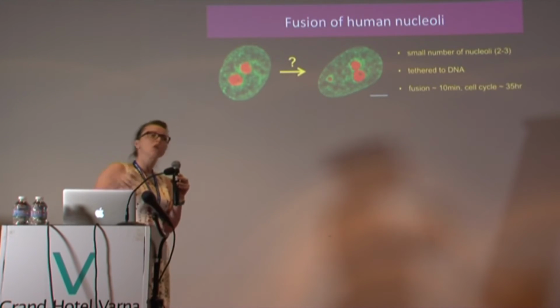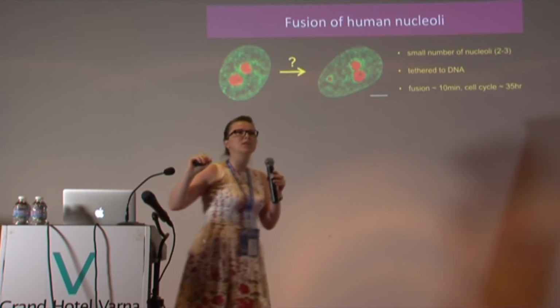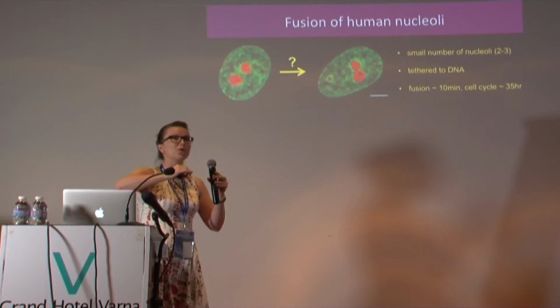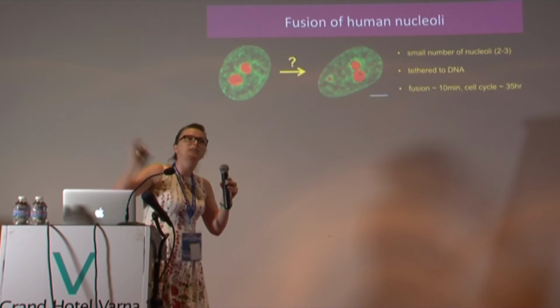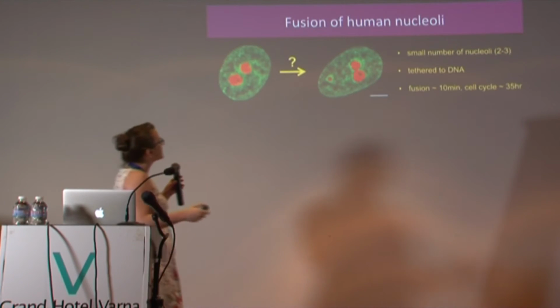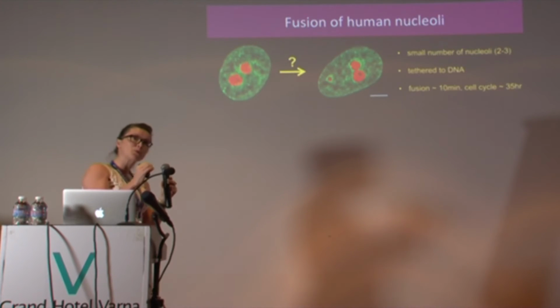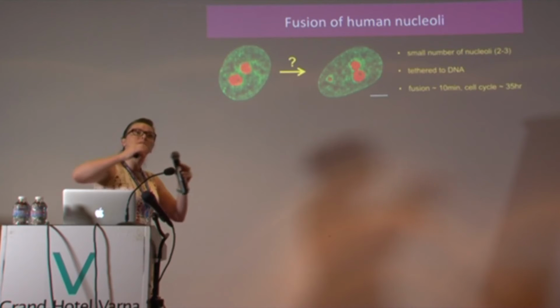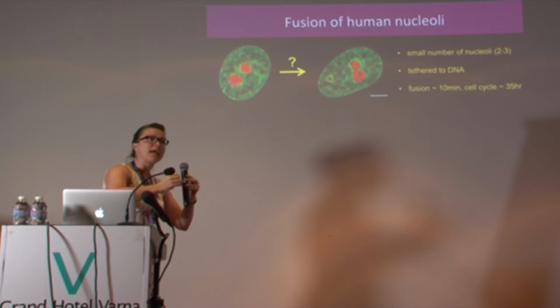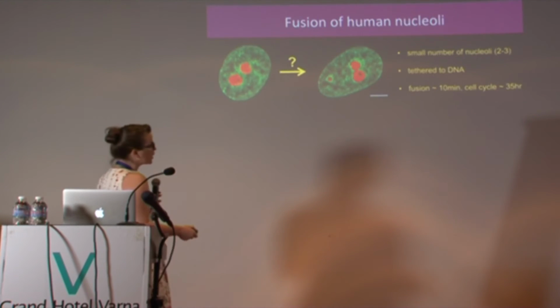Indeed, it's very tricky. Such an image was shown about 60 years ago for the first time, where people caught the nucleoli in the act, but they could not tell: is it a fusion of solid particles or coalescence of liquid droplets? In order to distinguish between these processes, you have to catch dynamic data. You really have to see how the shape changes, how the neck in this dumbbell shape grows. That's where the information lies.